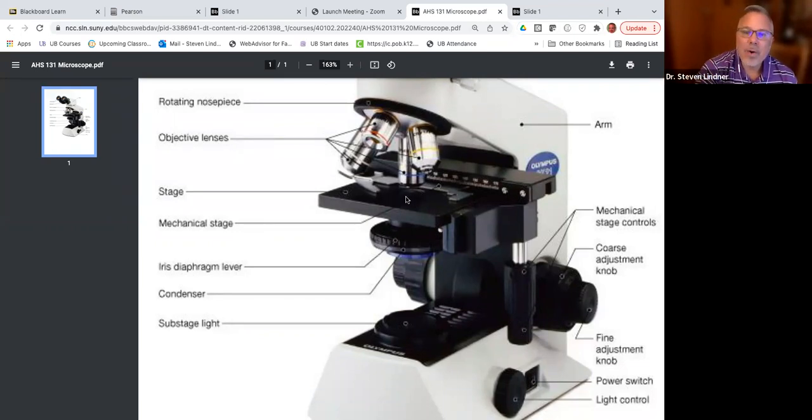So knowing how close these two are to each other is very important, because if you're too close, it makes more sense using the fine adjustment knob, whereas moving the coarse knob maybe 2 or 3 millimeters can move the slide up significantly, whereas rotating the fine adjustment knob almost one full rotation around moves the stage ever so slightly.